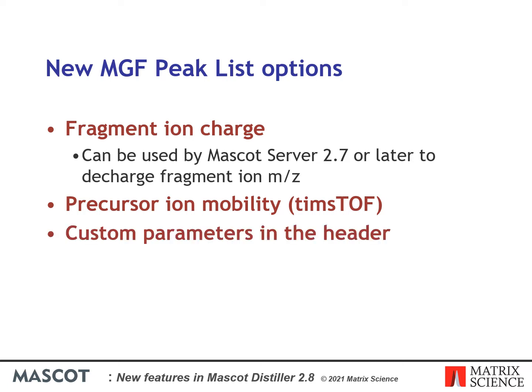You can also add custom parameters to the MGF header. These can include search options such as options controlling variable modification permutation added in Mascot Server 2.7, or your own custom parameters which will be passed through to the results.dat file after searching. These can be used for embedding useful metadata into the results.